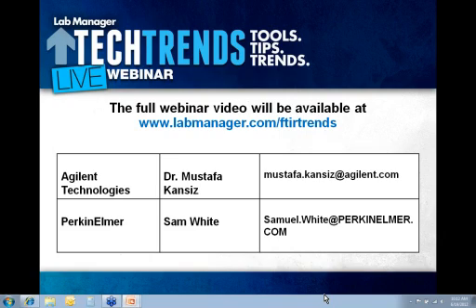Basically, I would agree. The size of the image, if you're in transmission mode or reflection mode, is the span of your stage. The standard stage is pretty much the same as the Agilent. We do offer a larger stage, but again, it varies time, so you've got to consider that. Really, when you're talking about microscopes, you're talking about a reasonably small area. In ATR imaging, then it's the size of the crystal. Our standard crystal is 600 microns in diameter. We also offer a 1200 micron ATR crystal.